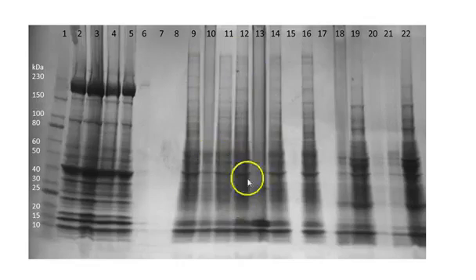This is the kidney homogenate on this gel, and we can see the largest proteins are at the top. The kidney clearly has a lot of really large proteins, and the liver doesn't have as many, and the heart doesn't have as many large proteins, but the heart has some really abundant protein.